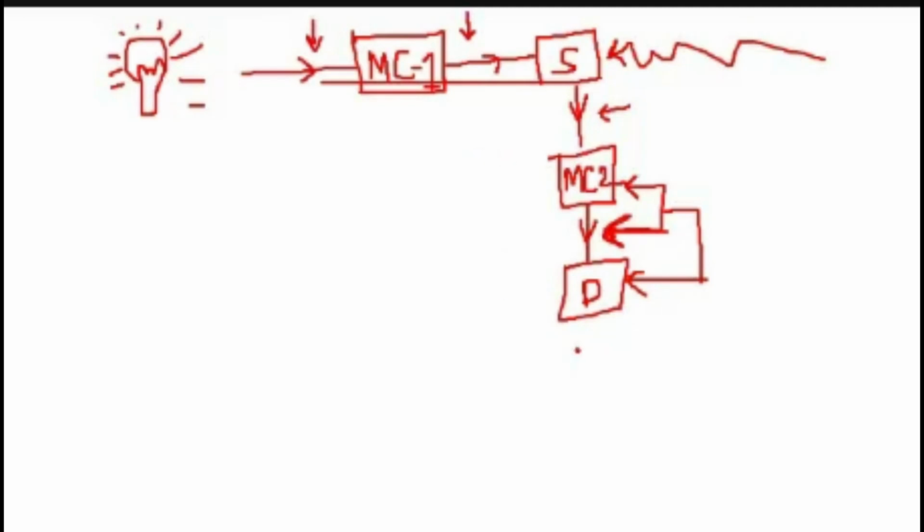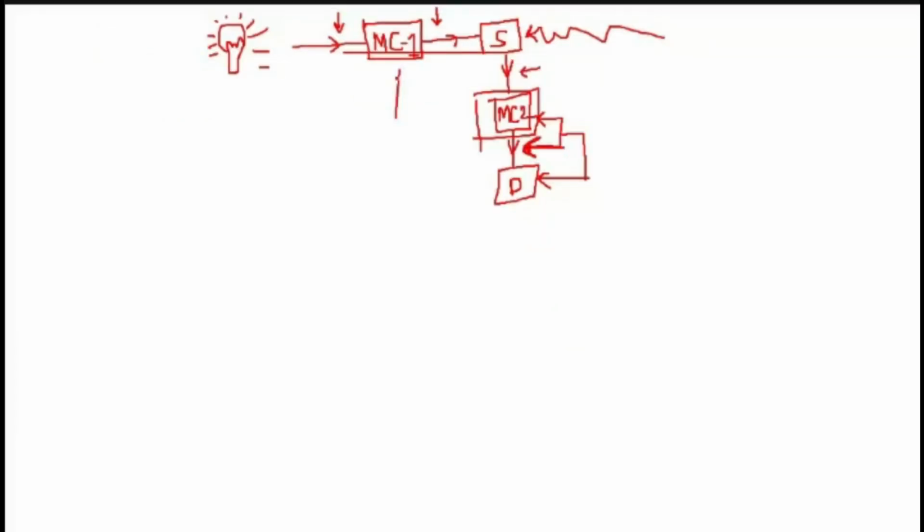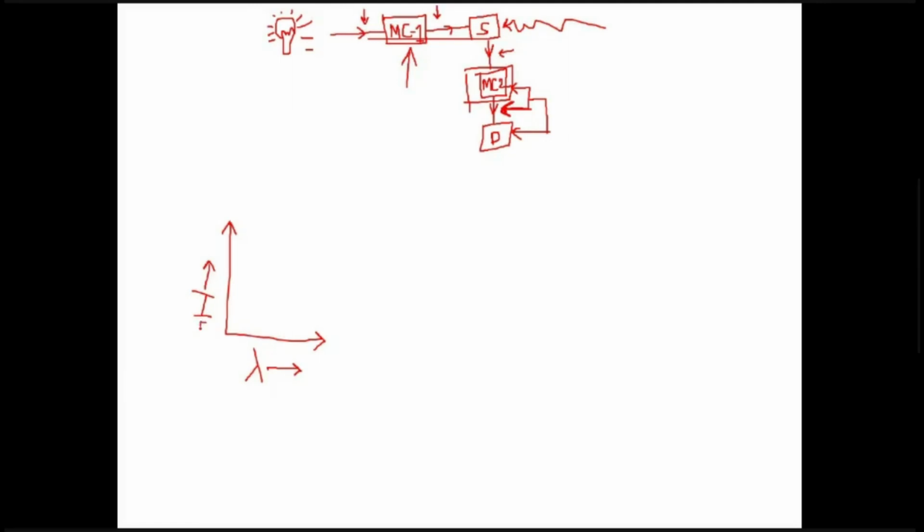So what we are going to do when we are observing this spectra of excitation wavelength, we are going to keep the emission wavelength fixed, and we are going to change the excitation wavelength. So when the excitation wavelength is being changed, we are actually measuring the emission wavelength itself. We are measuring the intensity of the emission wavelength. This intensity measured is of emitted light at a fixed wavelength. But the wavelength that is being changed is excitation.